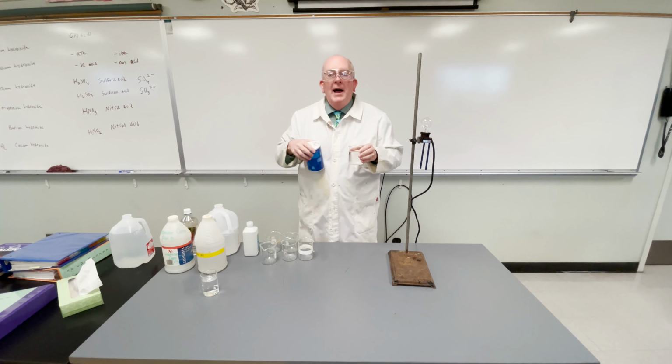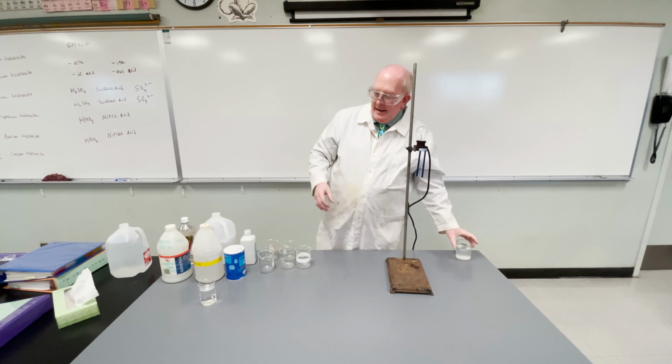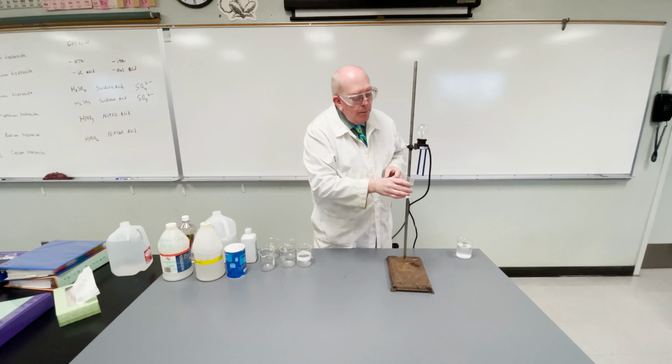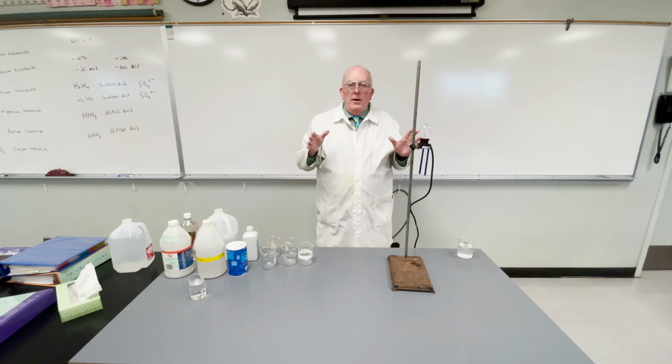okay? Now, when I put this here, look at what happens. That light bulb goes on. Electricity is being conducted through that solution, okay? Now, just to keep everything clean, I'm going to take that distilled water beaker again, and I'm going to rinse that off a few times. You see it's still not conducting, so that salt doesn't interfere with any other part of the demonstration.